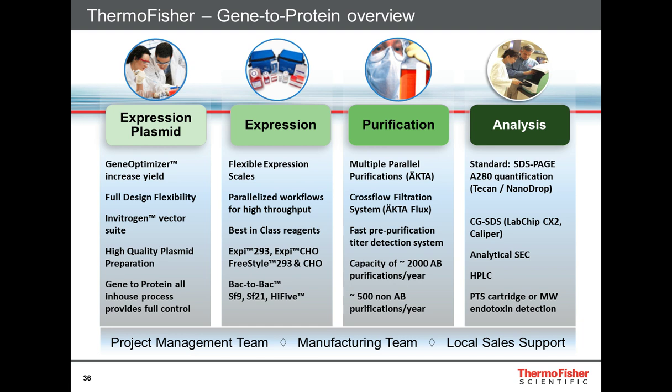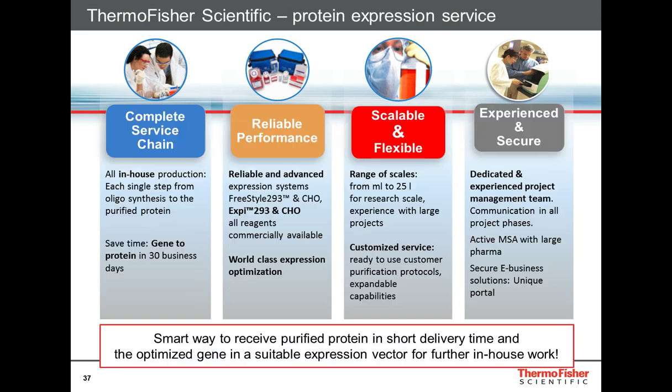We analyze the proteins that we synthesized with standard PAGE, 280 nanometer quantification, also with a Blitz if it is an antibody, with HPLC, and we are just setting up a mass spec, so that will be part of our analysis QC as well.